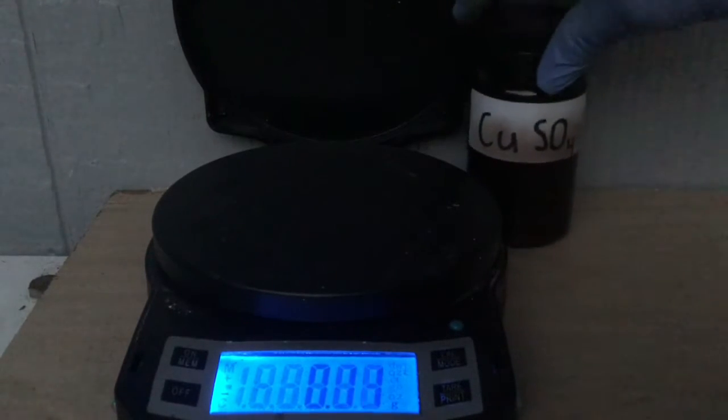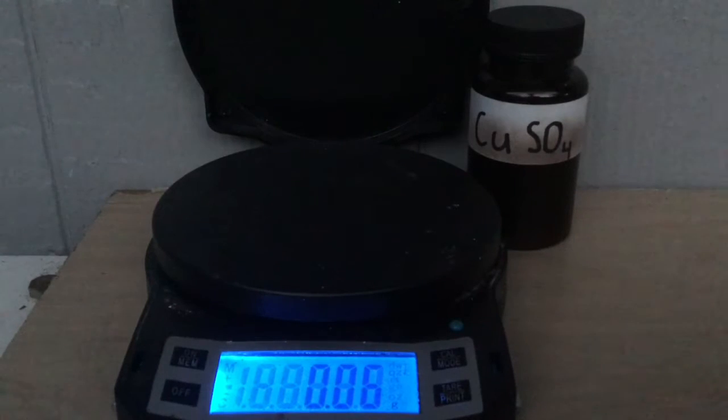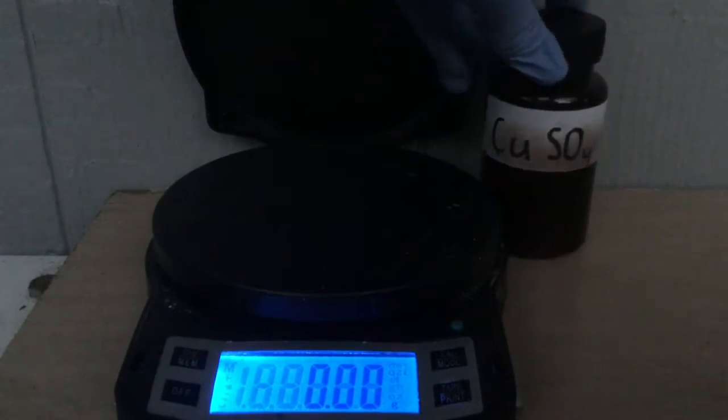Anyway, we're going to be making anhydrous copper sulfate today. It's a pretty useful chemical in the lab — well, any anhydrous salt is useful — because you don't have to worry about water content in the reaction. The first step is to weigh out some copper sulfate pentahydrate.